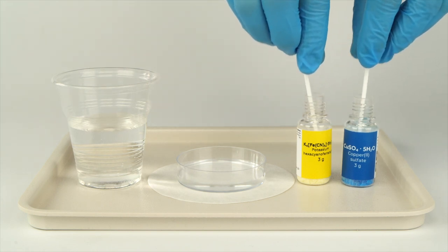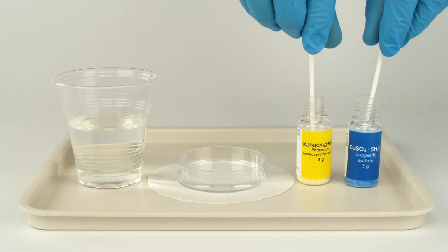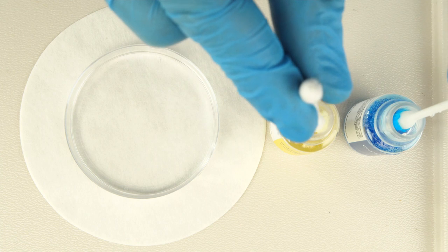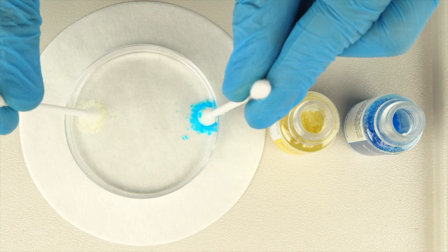Take the swabs out of the reagent bottles and immerse them simultaneously in the water at the opposite ends of the petri dish. Both cotton swabs should be touching the bottom of the dish. Hold them there for several seconds.